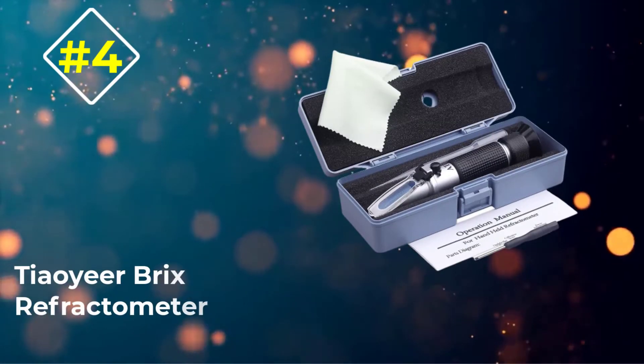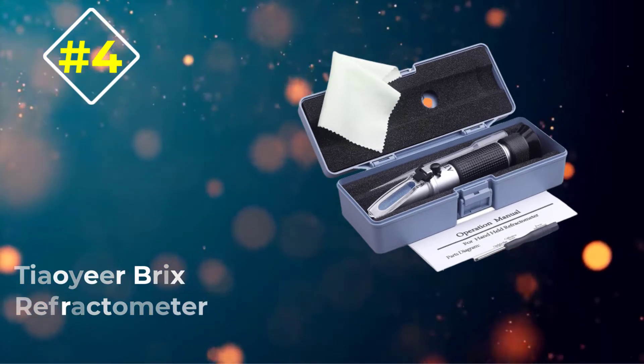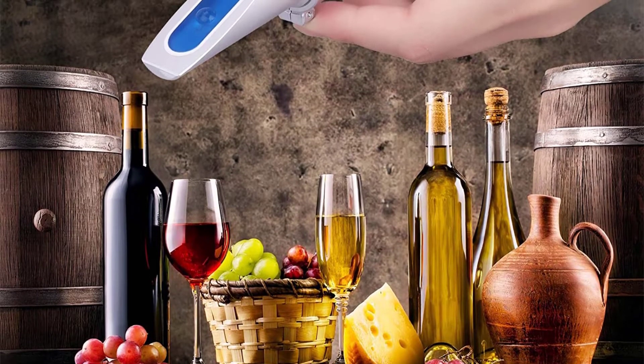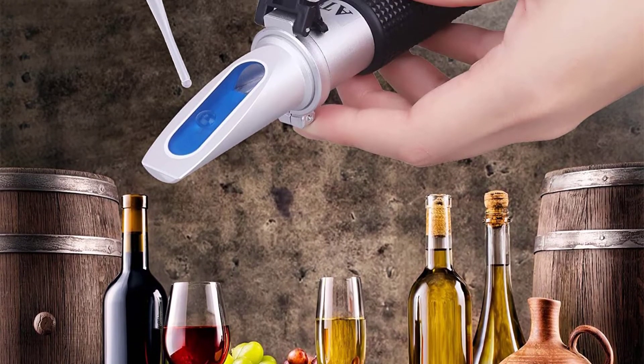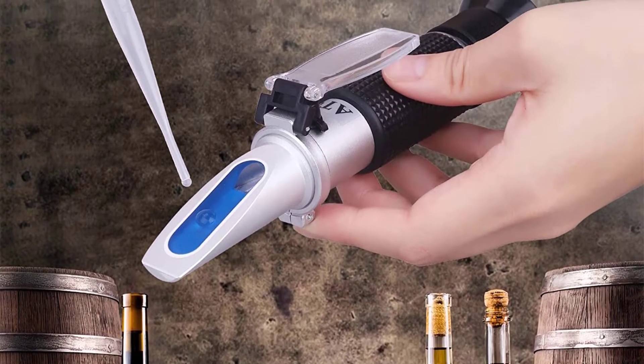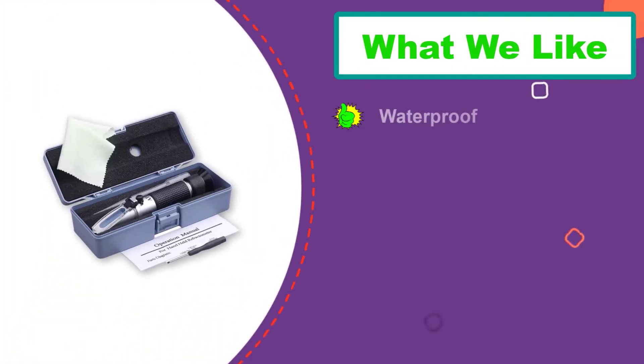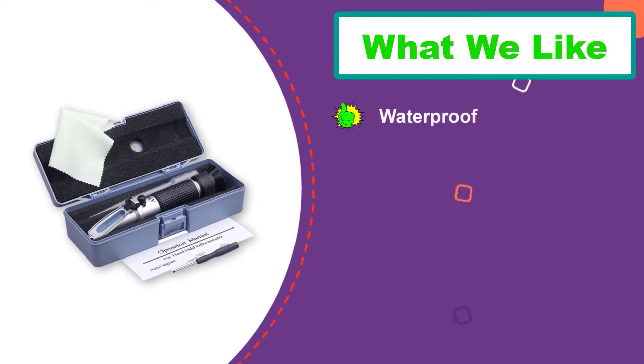Number 4: the Tyyear Brix Refractometer. This refractometer from Tyyear has one feature we've not seen from the others — it's waterproof, though we would not recommend submerging it in water. This is useful for the clumsy brewmaster, or one who has enjoyed one too many of their own beverages.